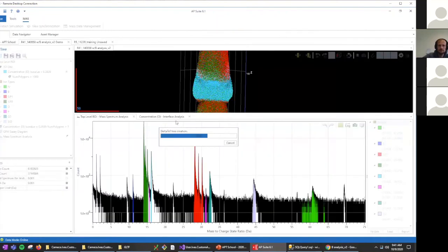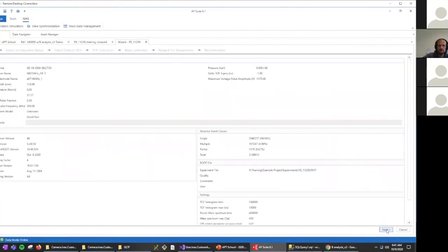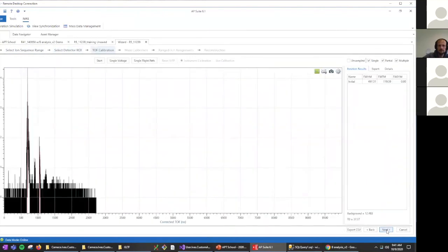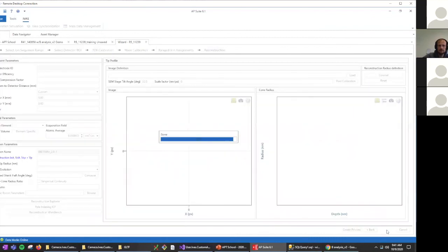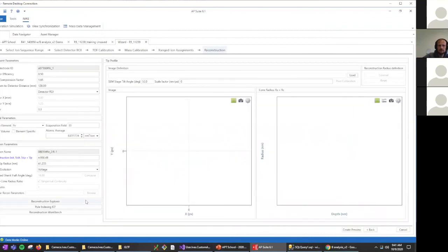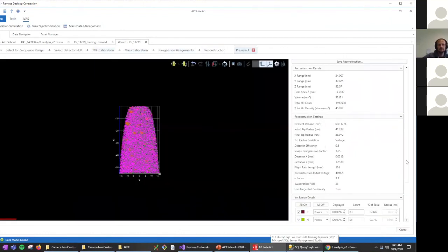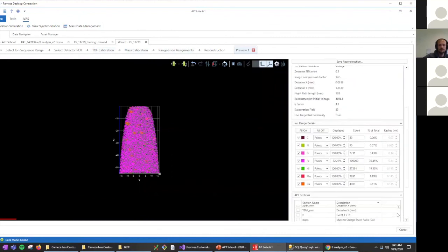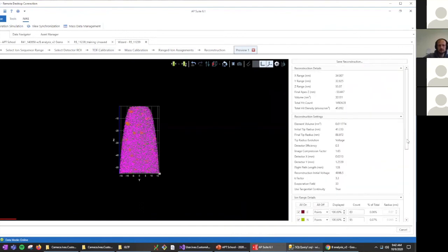But one thing that's very important for us is access to the metadata, and access to as much data as possible in as consistent a way as possible. Because what's difficult for us is if we have to change our approach on a fairly regular basis.